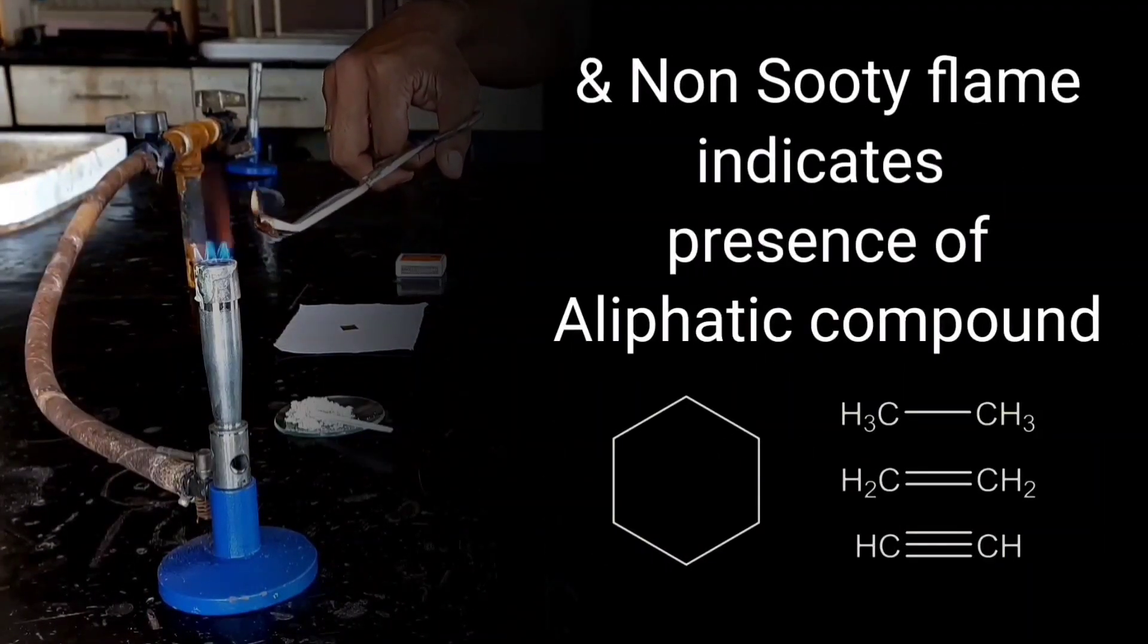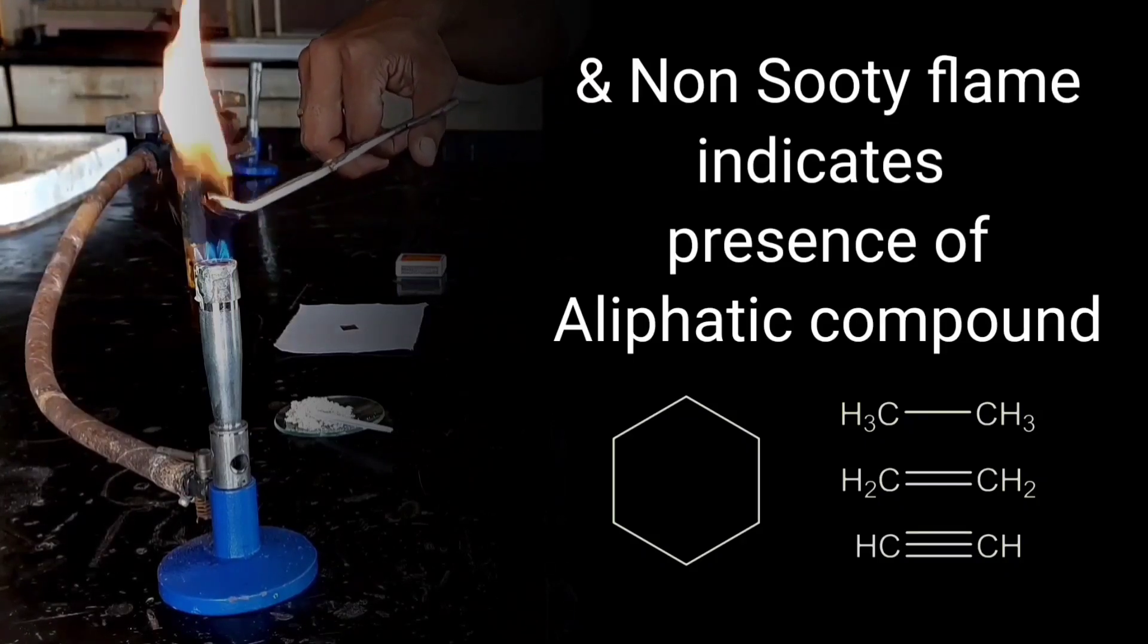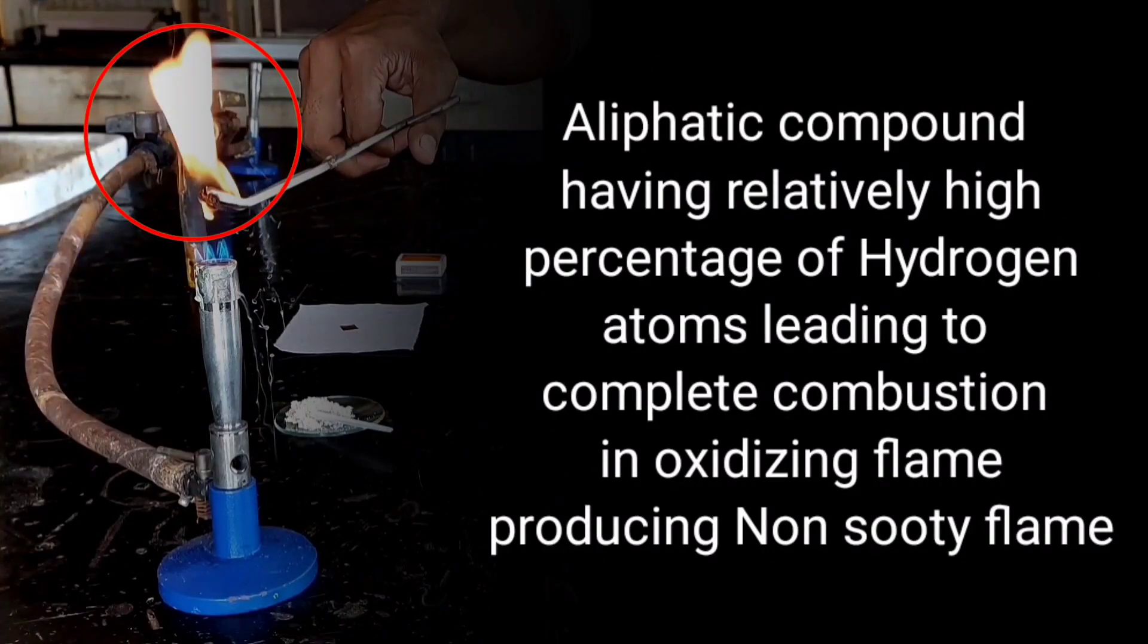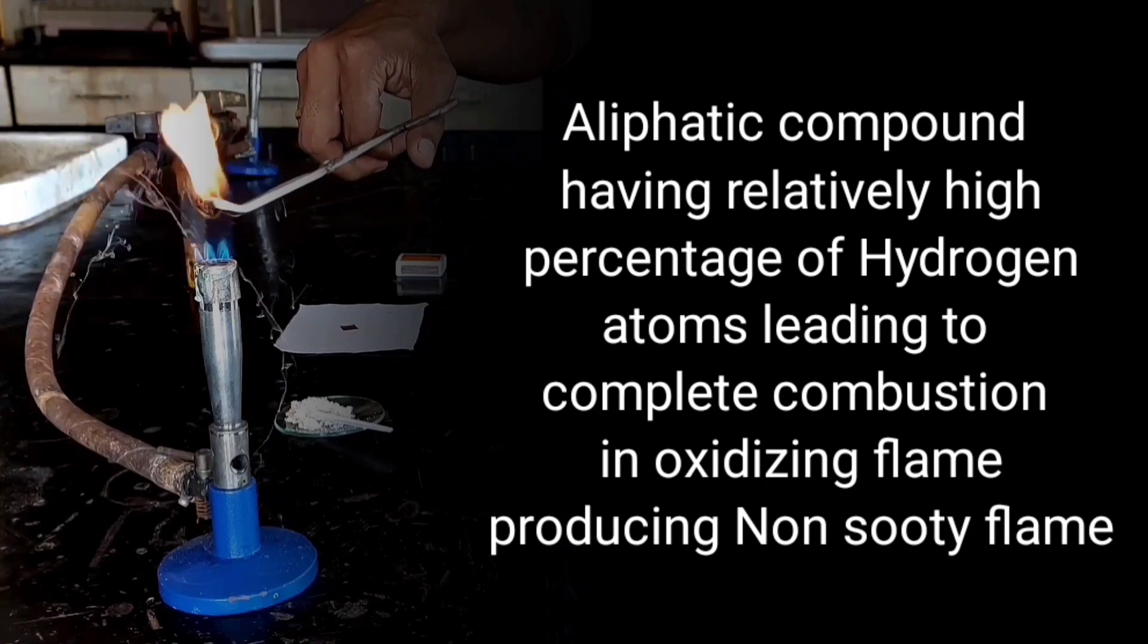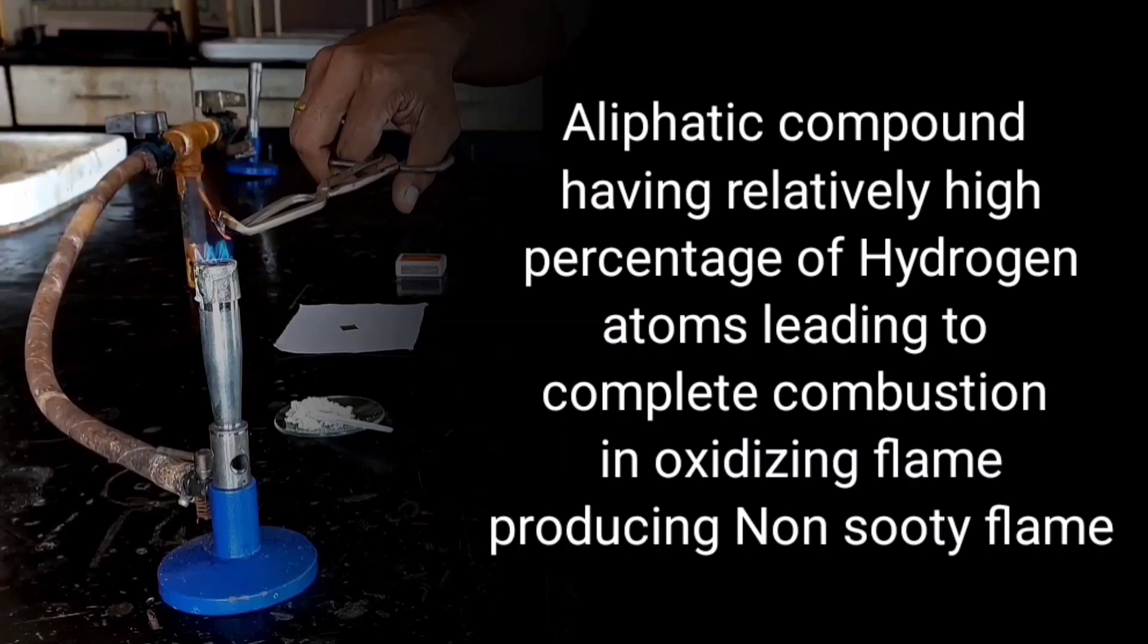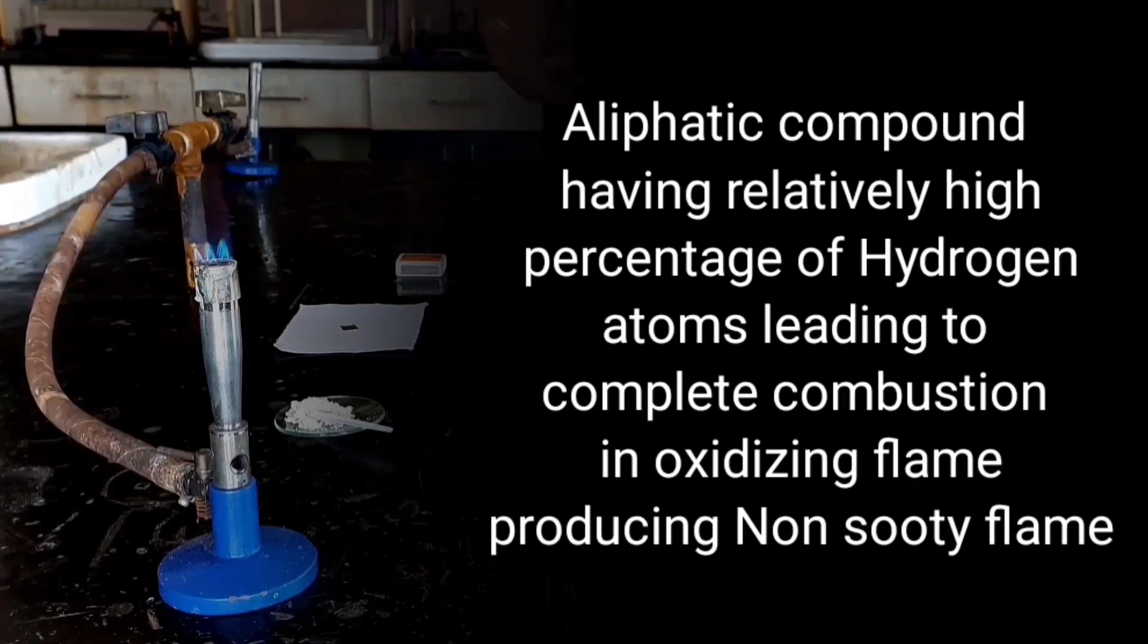And non-sooty flame indicates presence of aliphatic compound. Aliphatic compound having relatively high percentage of hydrogen atoms leading to complete combustion in the oxidizing flame, producing non-sooty flame.